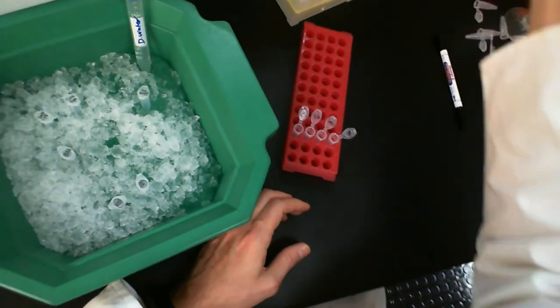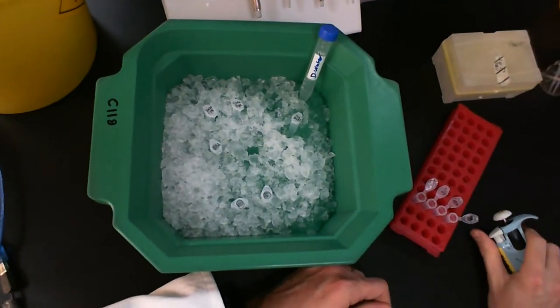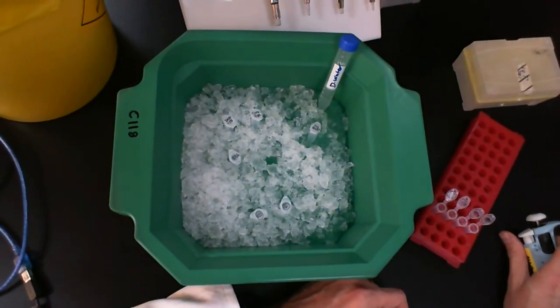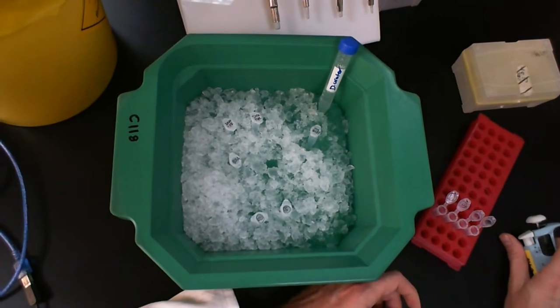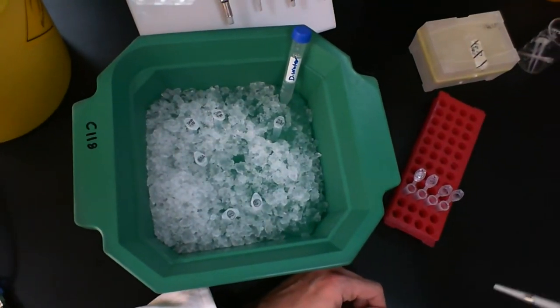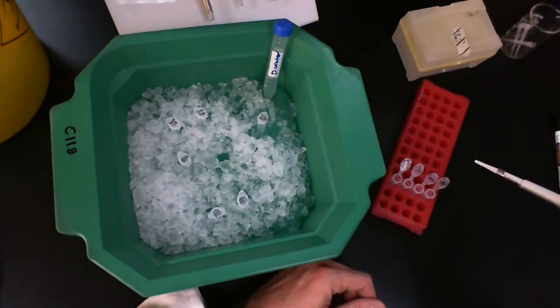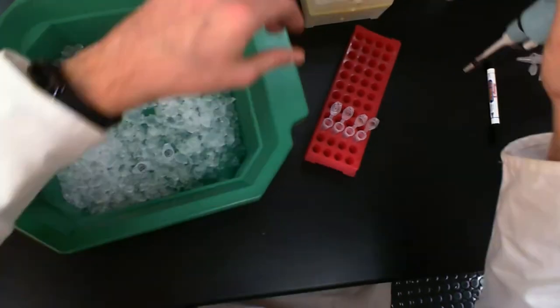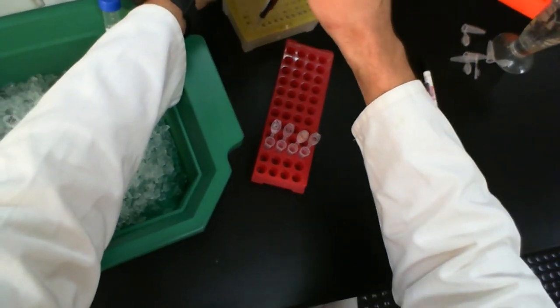And so here I am. I have water and buffer in here. Again, it would be helpful to have a table next to you if you want. That'll help you keep track of everything. Okay, so from now on we have a buffer in all of these tubes, so we're not going to be cross-contaminating our samples with the buffer, so I'm going to be changing tips in between. Okay, and so again, from now on I'm just going to start adding things one at a time.